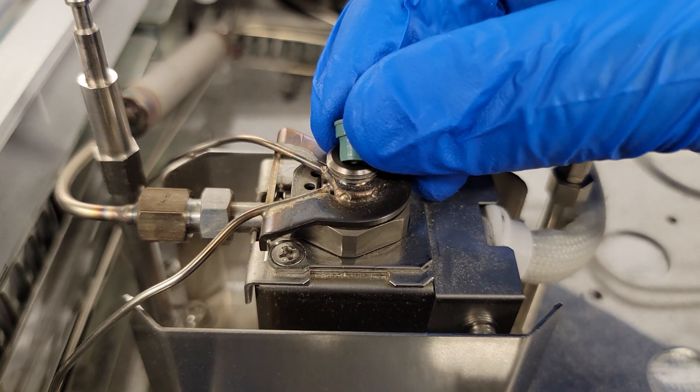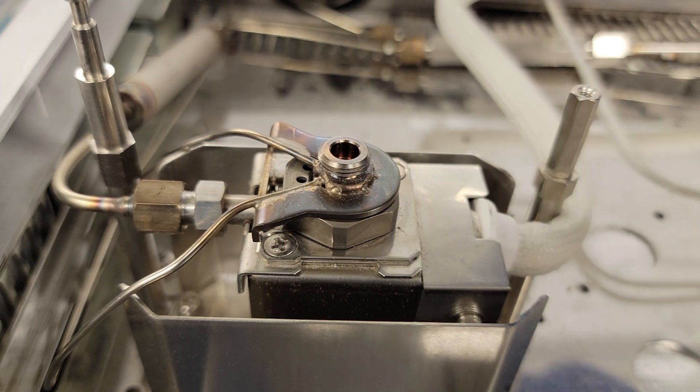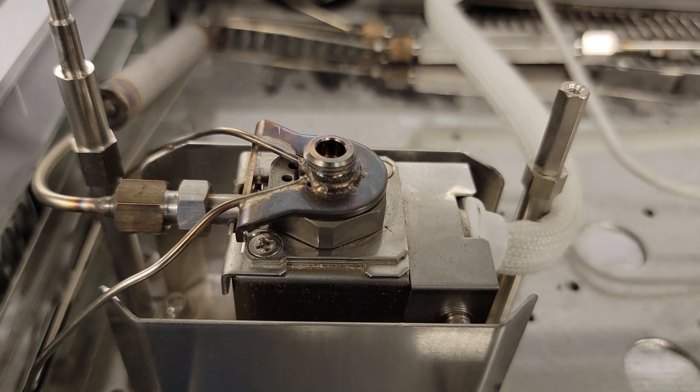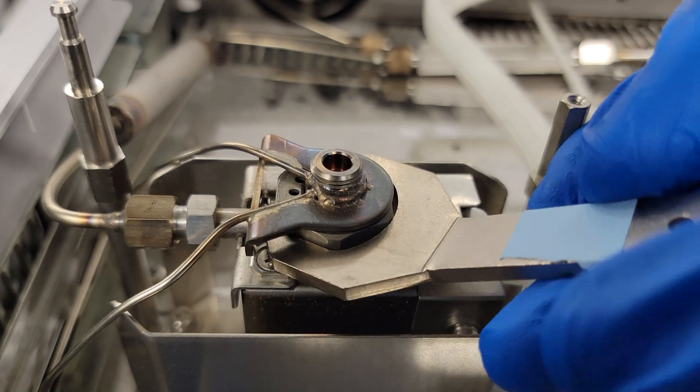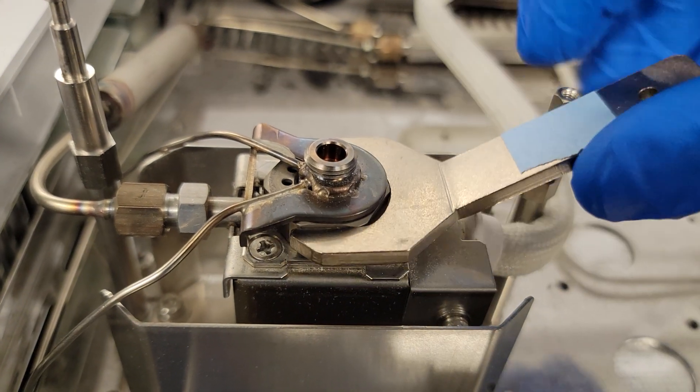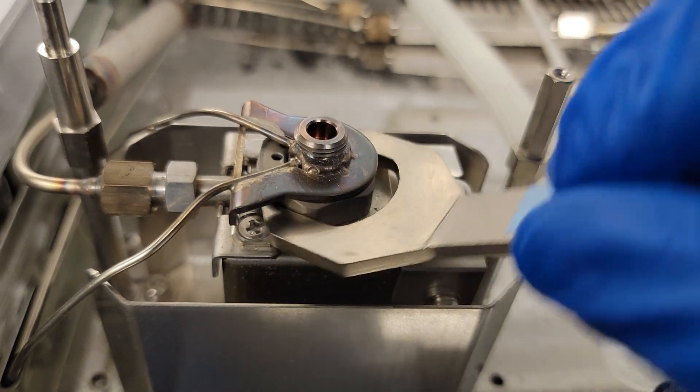Here is the septa - it makes a little hiss sometimes. I'm going to pull that straight out and set that to the side. Then I'm going to grab my wrench. Lefty loosey, righty tighty, so counterclockwise.